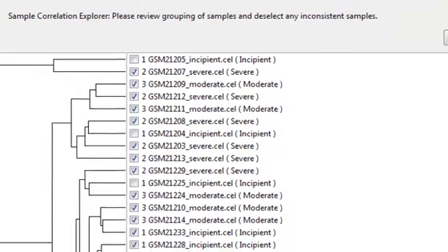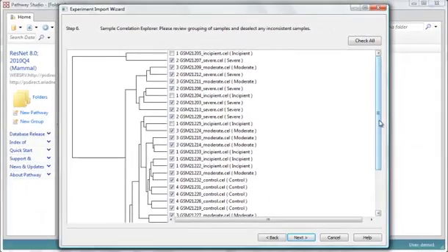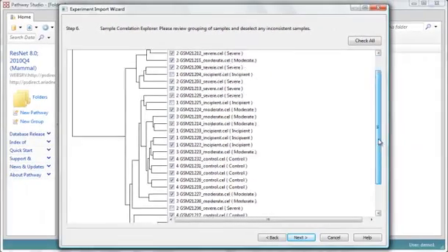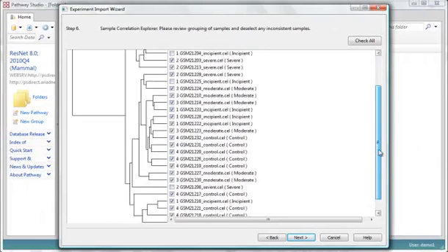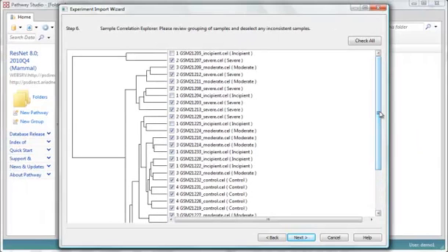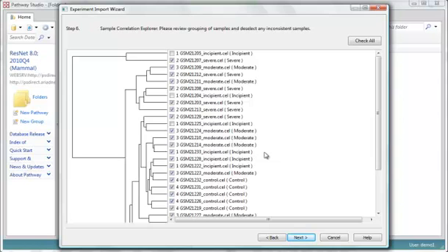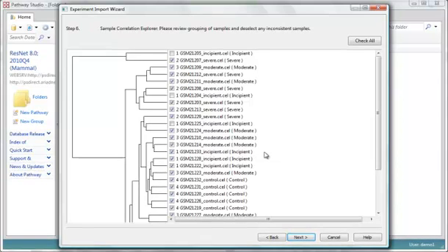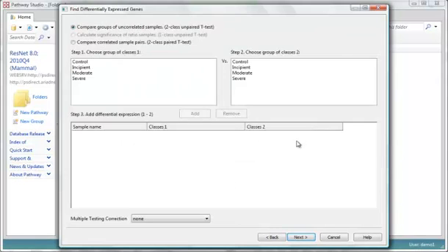So if I do that, then the data sets are actually very clearly correlated and separated. The point of this chart is not to try to derive outliers. It's actually to try to detect if you've made terrible mistakes in your labeling. I'm going to click next.